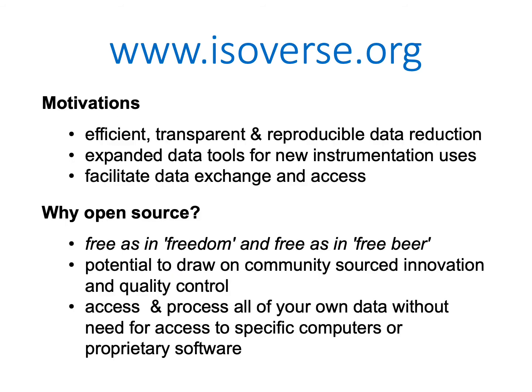In addition to making reproducible data pipelines, we were motivated by trying to create tools that would make it possible to expand instrument uses beyond what's typically possible in the vendor software, because we might be trying to do new kinds of measurements that were not anticipated when the software was first developed. And of course, which is a big topic of this session, the third point here, to facilitate data exchange and make it easier for colleagues to access the information that goes into our processing pipeline. I'm not going to dwell on open source here, suffice to say we're excited about this potential to draw in community-sourced innovation and have quality control through the community in all the processing pipelines that we develop.